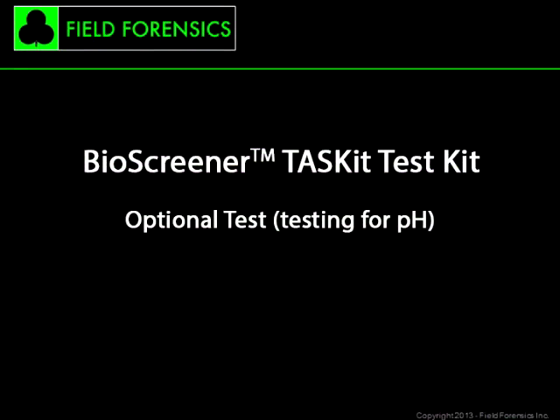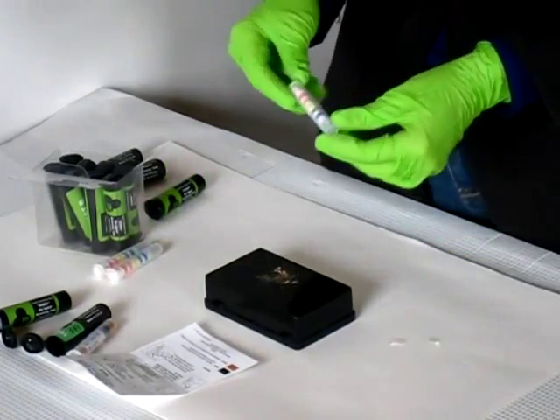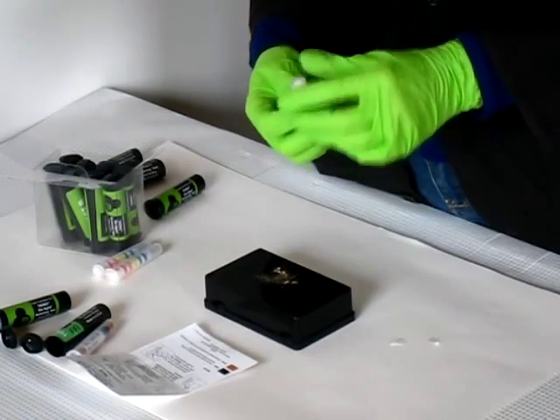The final test, when required, is a pH test. Once again, refer to the instructions and repeat the steps as they were completed for Test A and B. Compare the color of the tab with the scale of colors on the label.